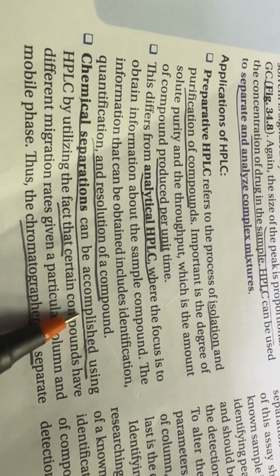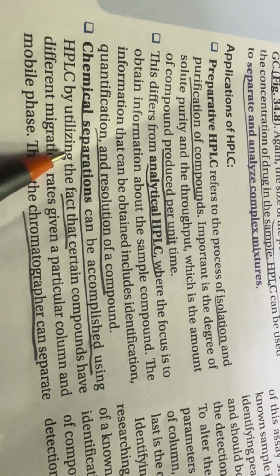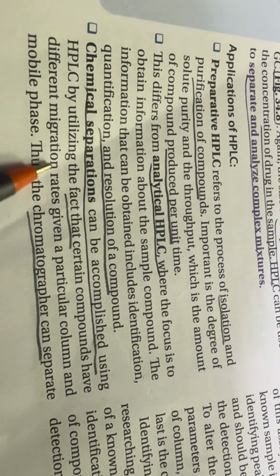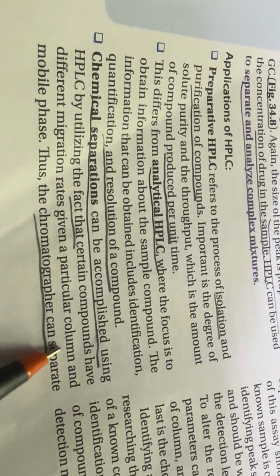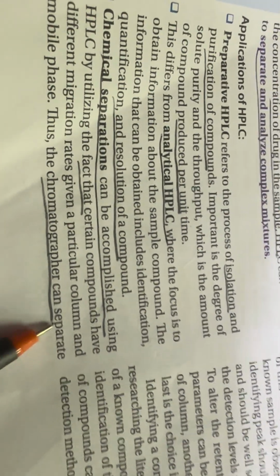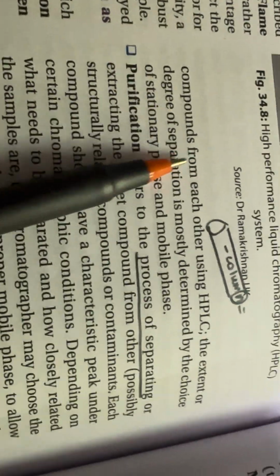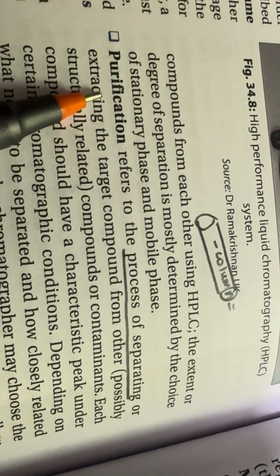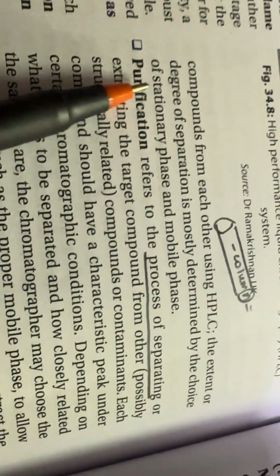Chemical separation can be accomplished by using HPLC, utilizing the fact that certain compounds have different migration rates given a particular column and a mobile phase. Thus, the chromatographer can separate compounds from each other using HPLC. The extent or degree of separation is mostly determined by the choice of stationary phase and the mobile phase.